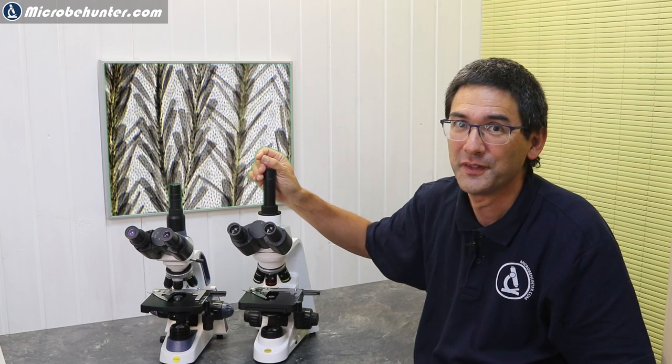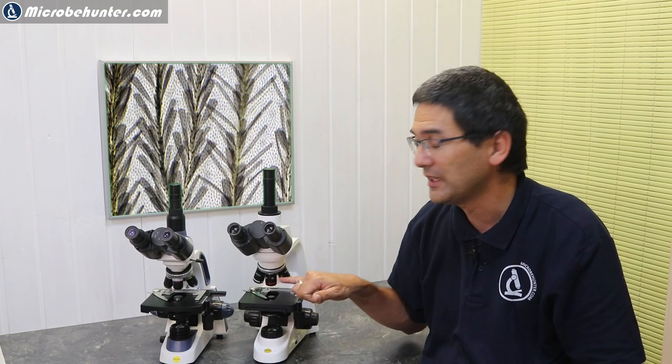I want to also now talk a little bit more about the difference in optics between those two. I already mentioned that the Stellar One has infinity optics while the other one has DIN optics. What are the advantages of having infinity optics over the DIN optics, or are there any advantages at all or disadvantages? Well I would say that for us end users right now the difference really is not so big. Generally the advantage of this microscope is that it has semi-plan objectives—these are pretty good objectives that give you a sharp image all the way to the edge, to the corner. Those objectives here are also not bad, but generally infinity optics are a little bit more expensive or significantly more expensive. If you compare the size you're going to see that those optics here, the infinity optics, are significantly larger as well. But for a purchasing decision I would say look rather for other features and do not make it so dependent on the type of standard that you have.